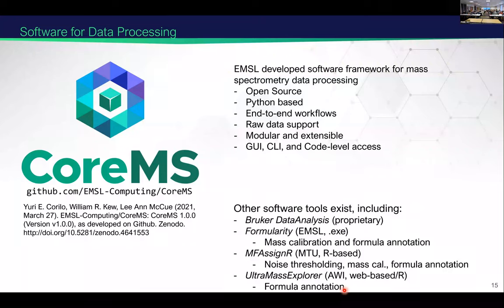In terms of data processing software, we've got CoreMS. This is an internally developed software at EMSL, but it's open source, it's Python based. What's really nice about it, and the main driving force behind it, is that it allows for a complete end-to-end workflow. So you can read in raw data in vendor proprietary format, do your entire processing workflow and get your output data in one routine, which means that it's fully auditable, you don't lose metadata, you can reproduce that code anywhere and you'll get the same result.